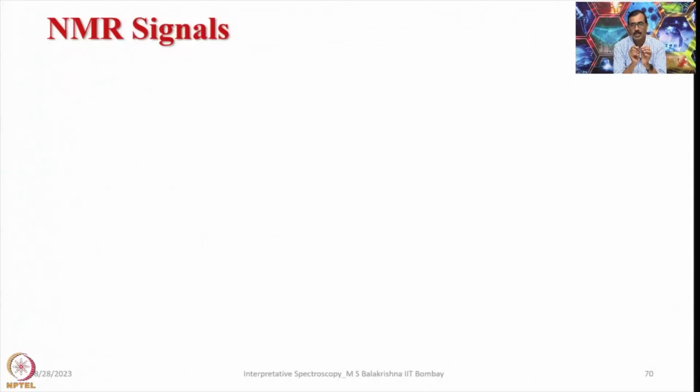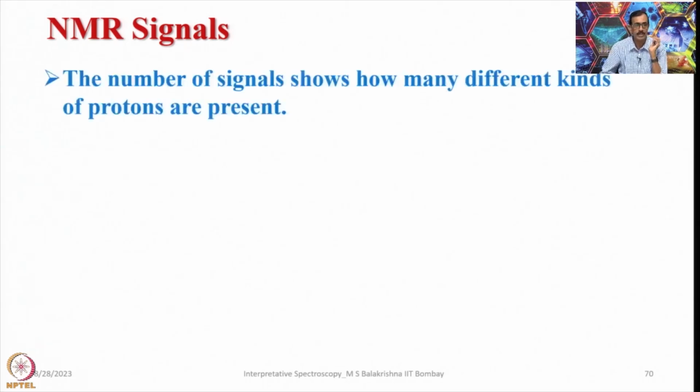This is the fourth lecture in the series. In my previous lecture I started discussion on chemical shifts. The signals, we call them chemical shifts. Let us go back to those few points. In an NMR spectrum we get NMR signals. What do these signals say about the molecule?